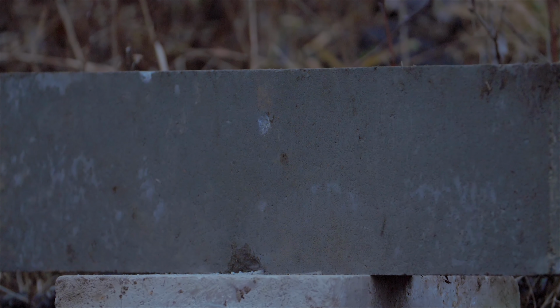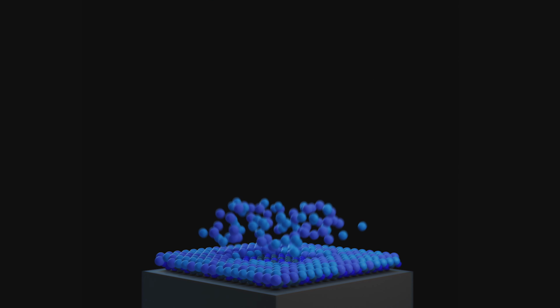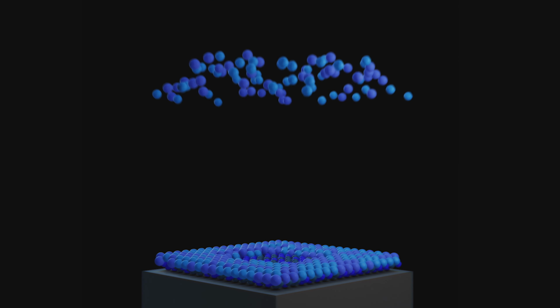Bunched mode, as the name implies, is a method where the pulse of primary ions is slightly decelerated, creating a bunched pulse of ions. Because the bunched pulse has a much shorter interaction time, the mass resolution is increased by orders of magnitude. With bunched mode, lateral resolution of a few hundred nanometers with mass resolution up to 11,000 can be achieved, reducing the problem of interfering peaks.